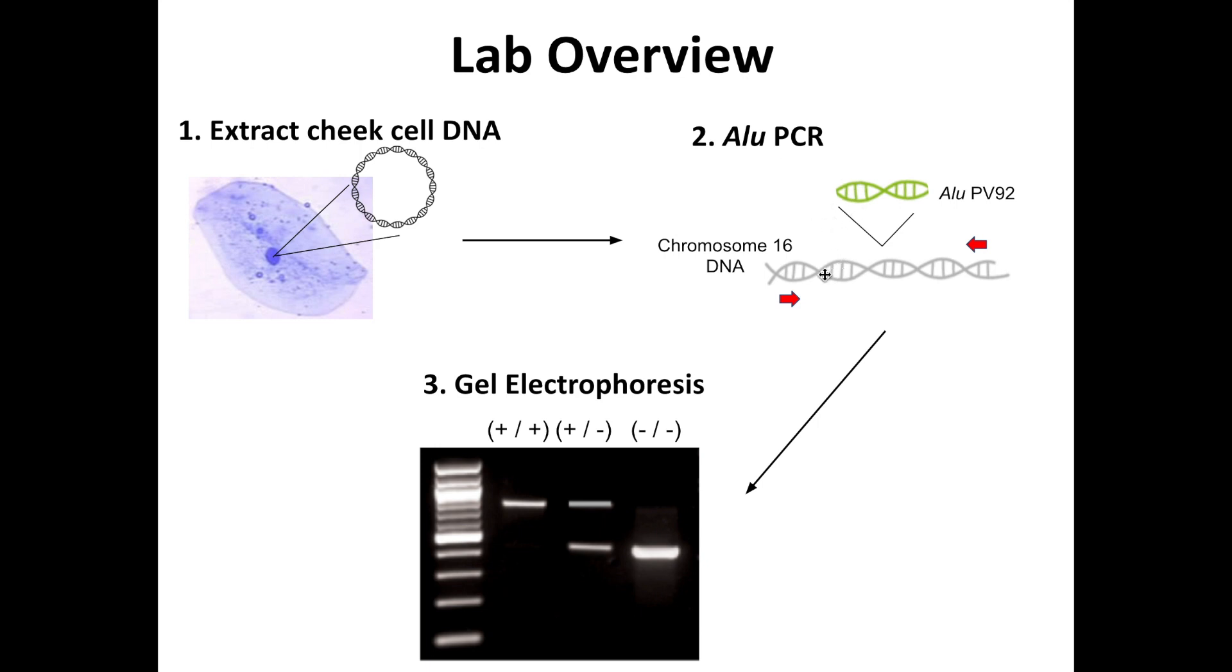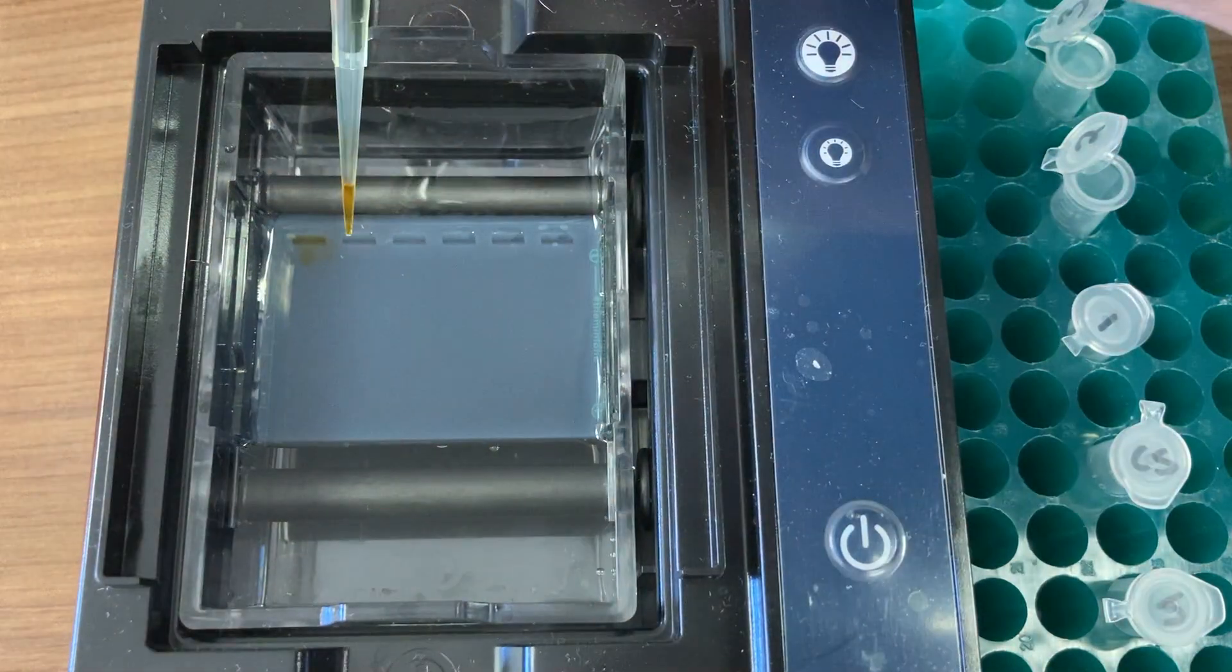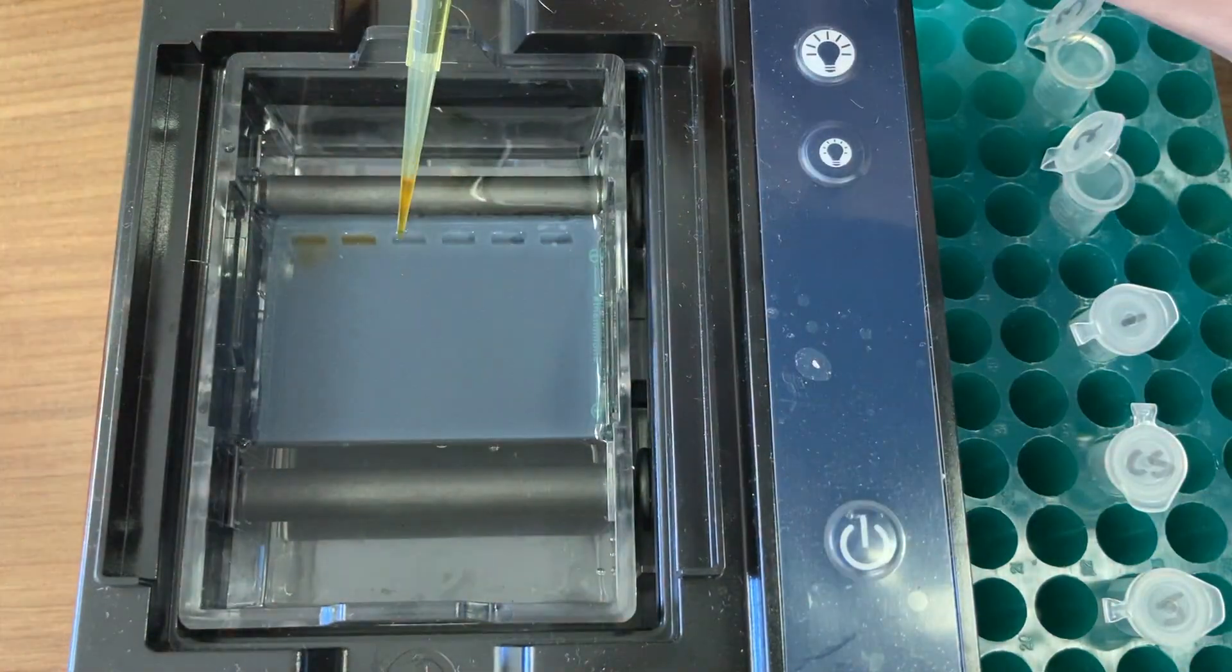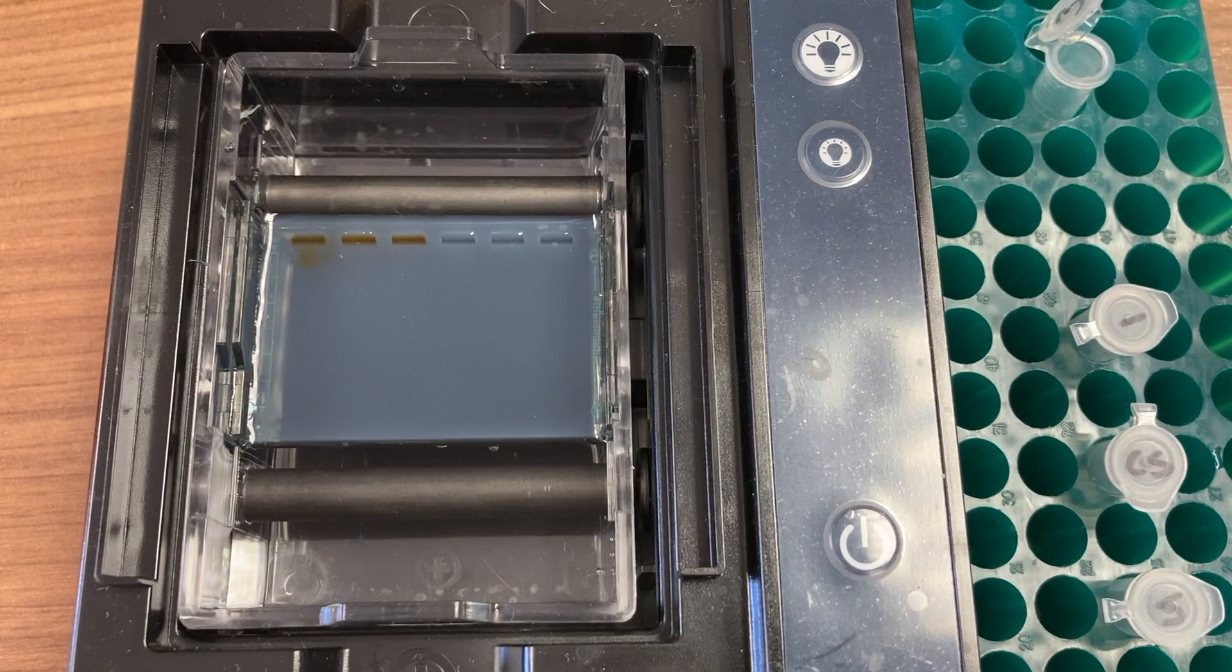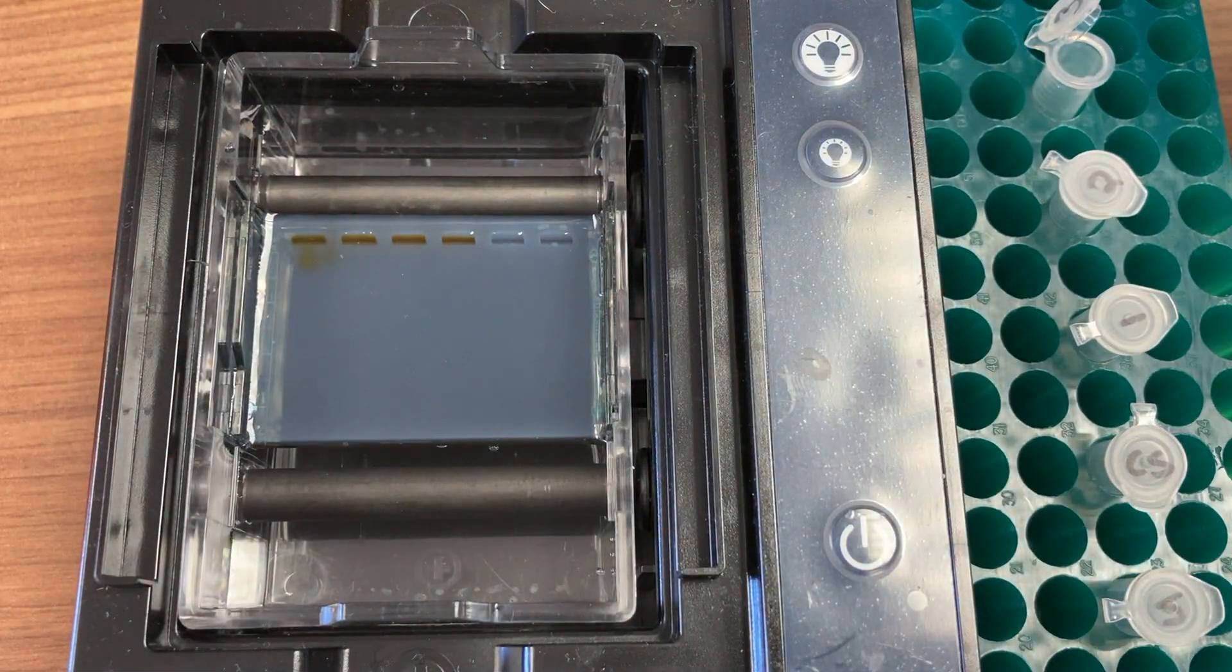Now, if our PCR is successful, we'll be able to visualize our ALU region through a process called agarose gel electrophoresis. We can visualize DNA by running it on an agarose gel like this one. We load our PCR samples with our DNA on one end of the gel and run electricity through the gel in a process called electrophoresis.